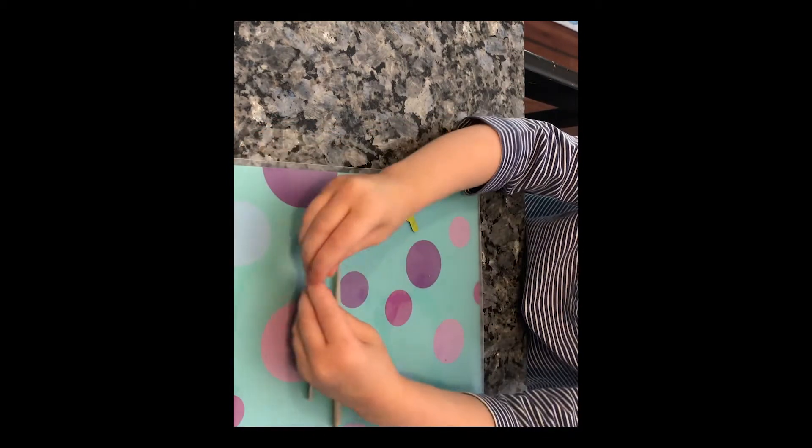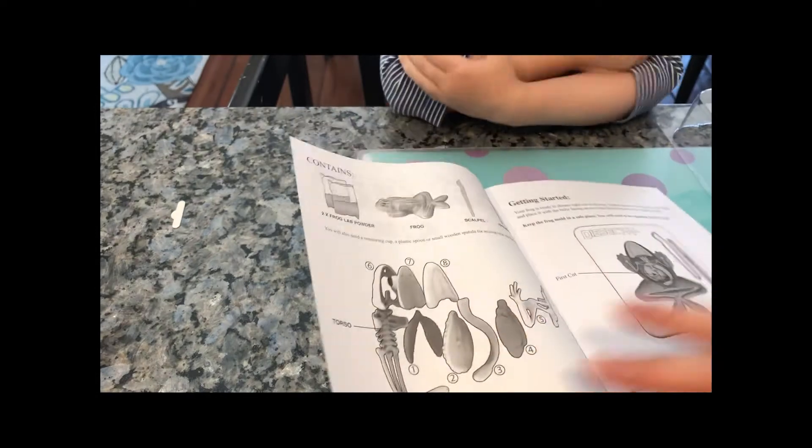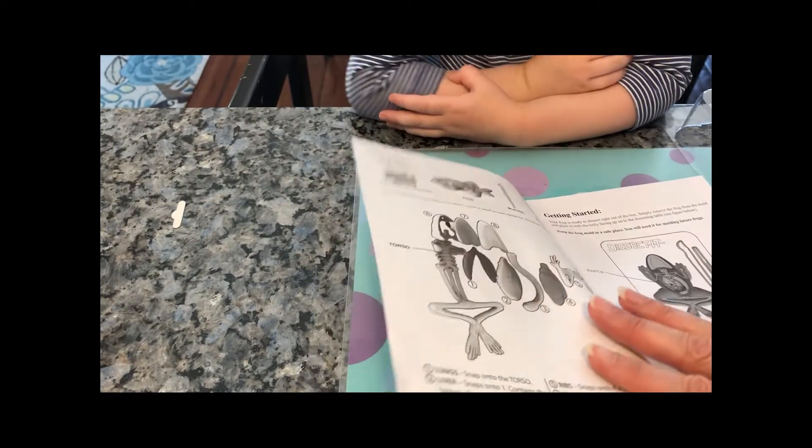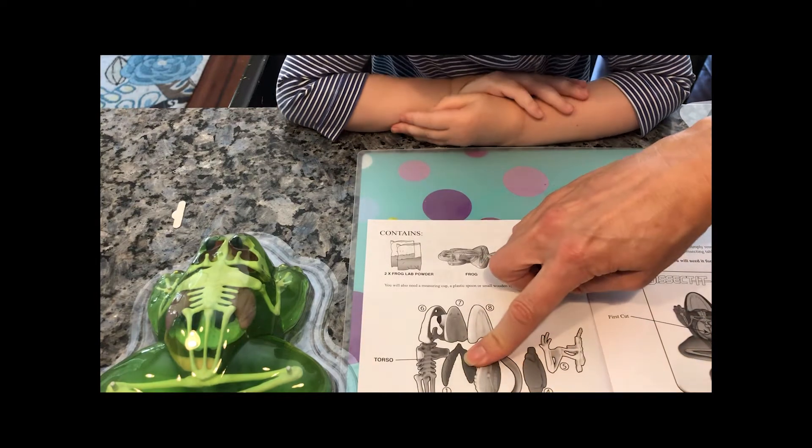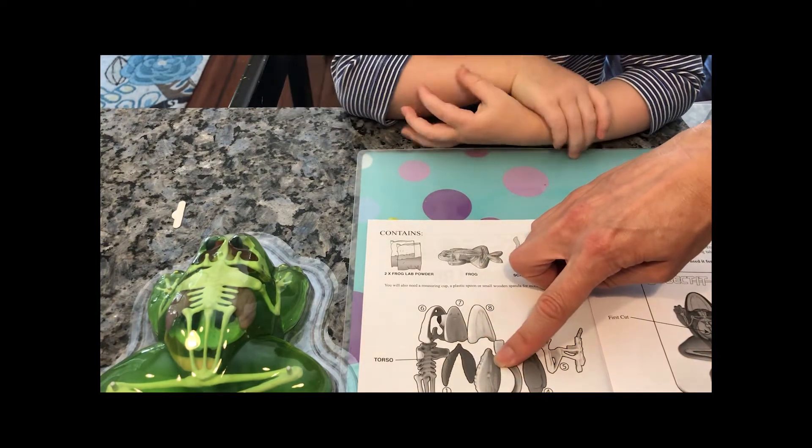Alright, we've got some cool tools to work with. You see our diagram? Let's look at it. We have lungs. This is what the lungs look like.